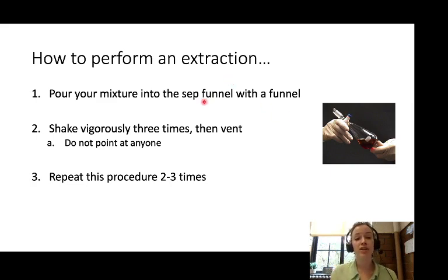When you're putting your mixture into the SEP funnel, after you've checked that the seals are tight, pour it in with the funnel. We want to get all of that mixture in there, so please use a funnel. Next, when your apparatus is set, it's time to shake and vent.